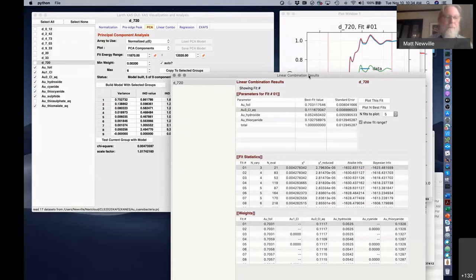I see. And the next one is, do we need to know the fingerprints of different components for the PCA? That's just working on the mathematical functions of the data. So you don't need to know what any of them mean, and it doesn't tell you what they mean. It just tells you how big the differences are between the data sets.